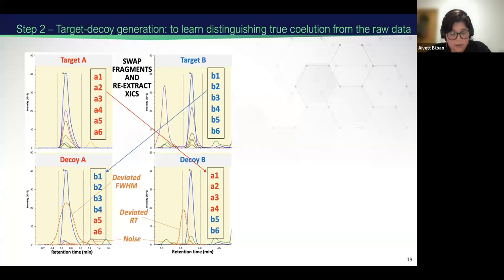And this is how we generate the decoys. Basically, we have this list of P groups that are high quality. We have a series of criteria, for example, they should have at least 3 fragments. In this list, all these that are called the targets are sorted by retention time. And then we create pairs. We associate these precursors in pairs to create the decoys. And there is also a series of criteria to improve the probability that it's not a decoy that is too fake or impossible to occur in nature, and is also not very close to the pair that will be created.